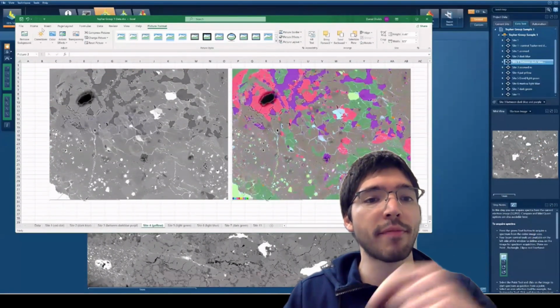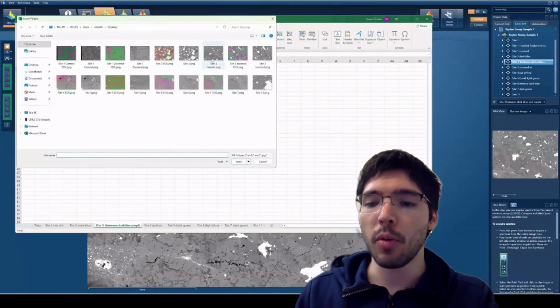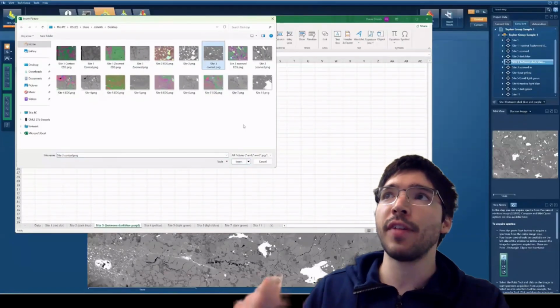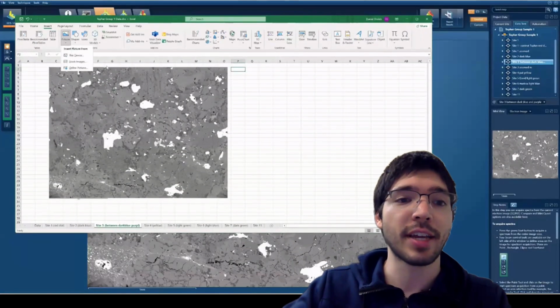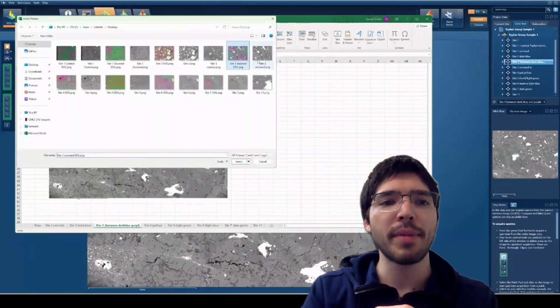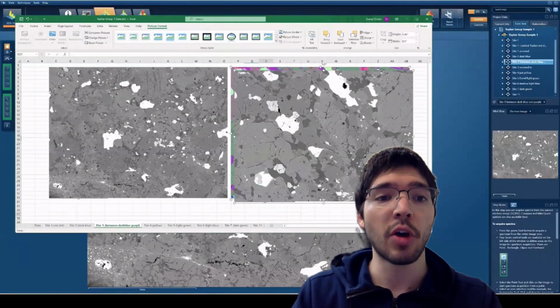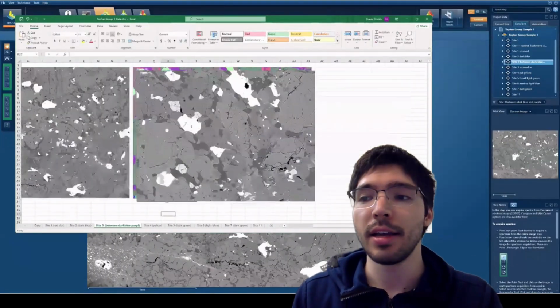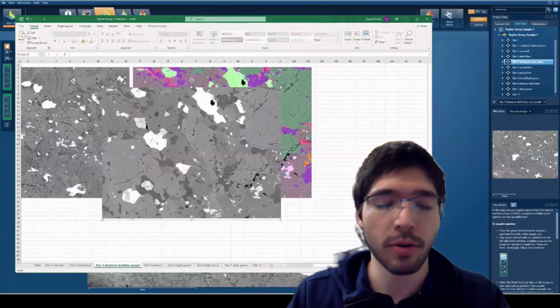In some cases, we have normalization tools to normalize to 100 if we need to. What I am more concerned with is if I hit a phase and get a total of, say, 60, and then I hit another phase and get a total of 90. The phase with 60, even if we account for errors, is probably still very low, and is likely a hydrous mineral phase, like a phyllosilicate or an amphibole.